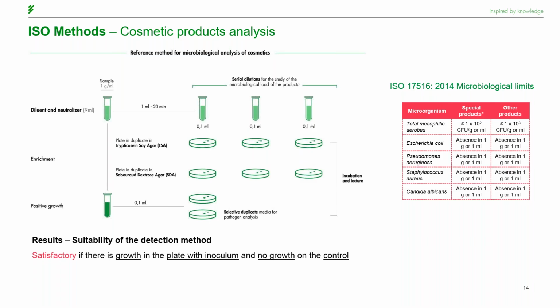So at the moment you do not supply Ogon LT100, or you supply it with a different formulation without Triton? Yes, we have been doing some work in the lab and some tests. As it has been banned, we cannot sell, supply, commercialize, or even use ourselves the Ogon LT100 with Triton.